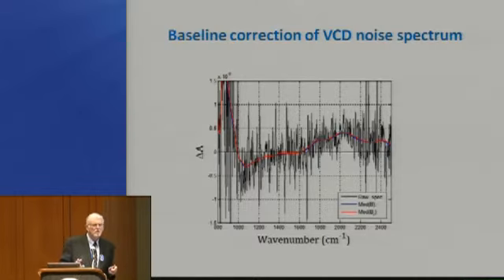That was the one that we've really looked at, and so providing that you don't start on that band, that you could start somewhere where the baseline is reasonably flat. It doesn't have to be as flat as it was on that spectrum, but if you start where the broadband has got some gradient, then it has problems there.